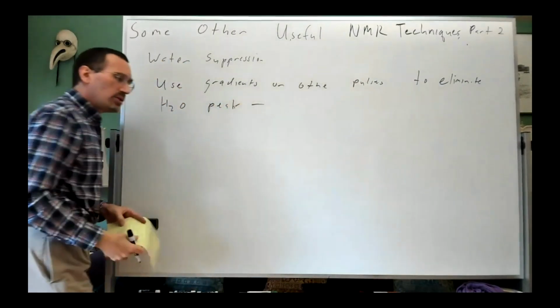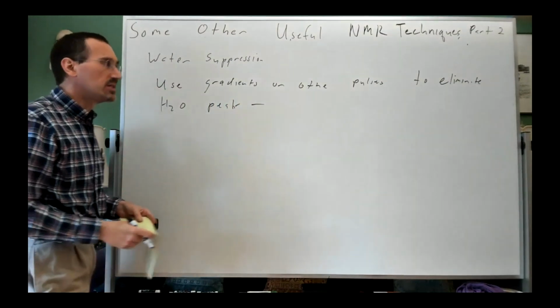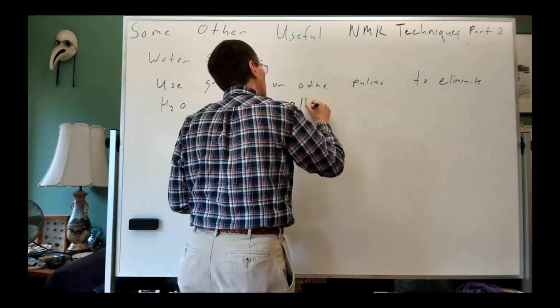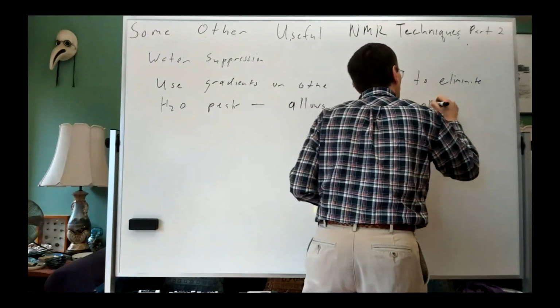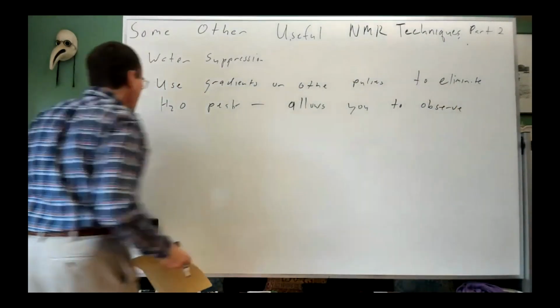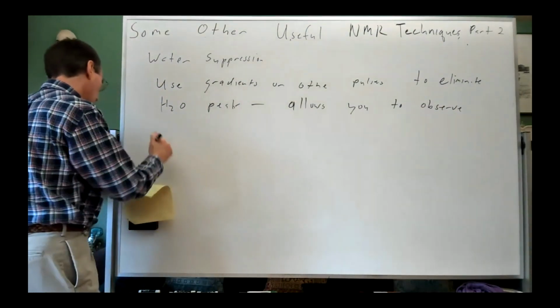And this allows you to observe your compound, observe your NHs. I'll say observe some NHs. And by some NHs, I mean amide NHs, yes, amine NHs, often no.